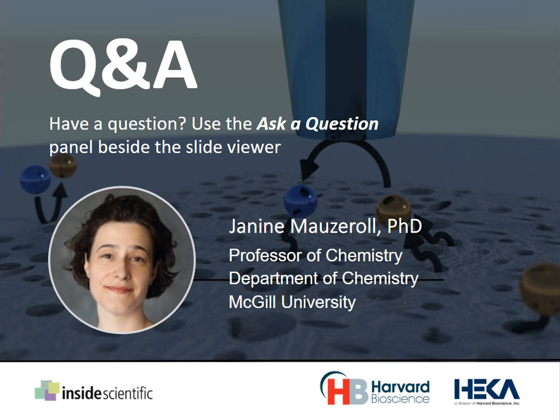So yeah, you can, for example, use the second story that I told, which was related to monitoring the intercalation reaction, but you can also use SECM to measure the porosity of the anode and evaluate how much the mass transport is limiting in the cathode.